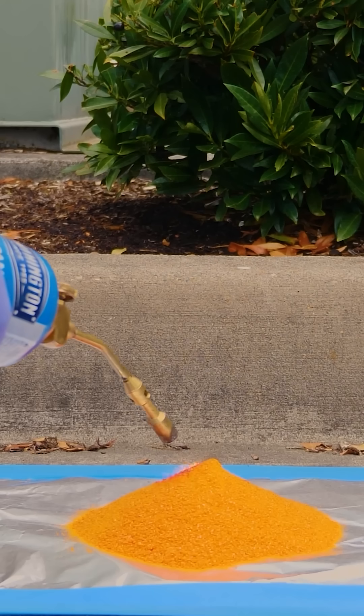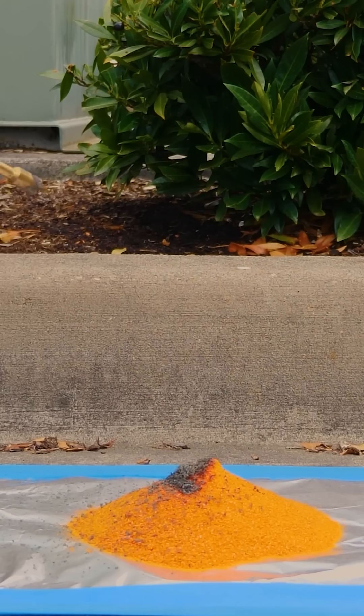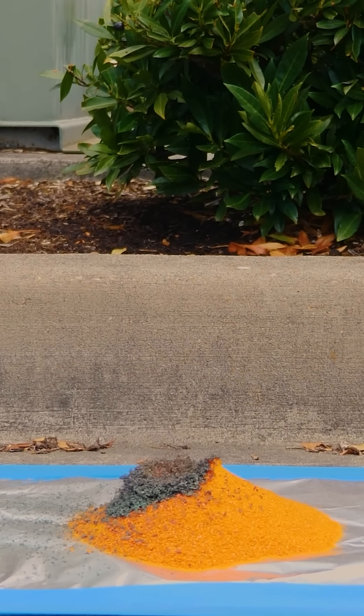The cool thing about ammonium dichromate is that it's pretty unstable, which means if you heat it up to just around 190 degrees Celsius, it'll start to decompose. So it creates this runaway decomposition, and it decomposes into chromium oxide, nitrogen gas, and water.